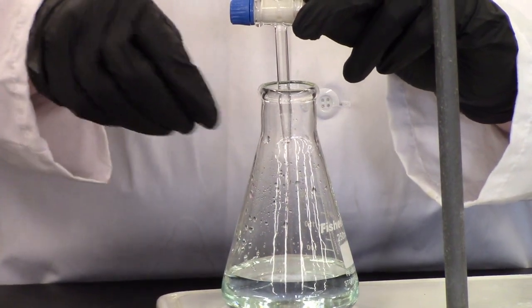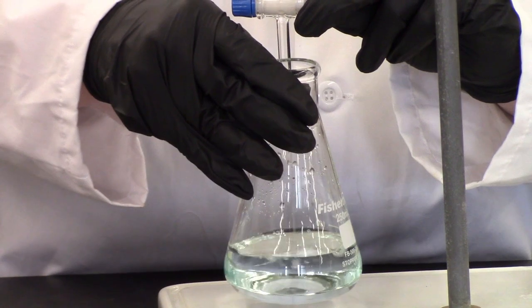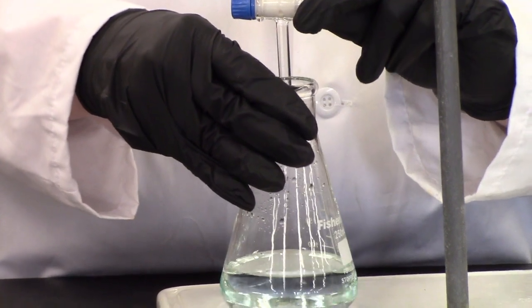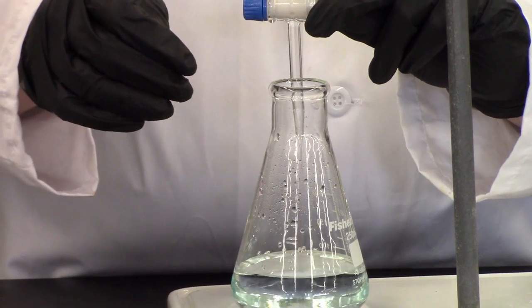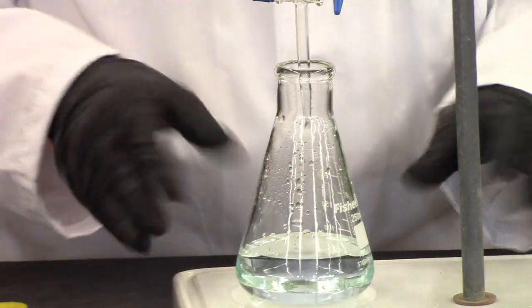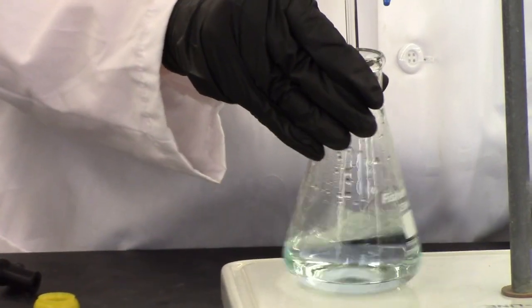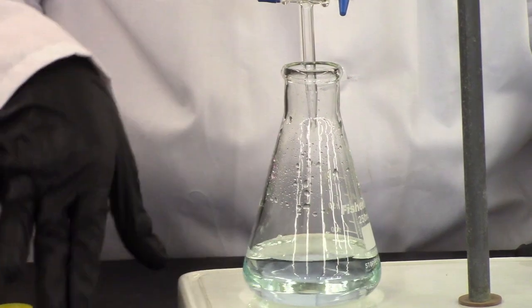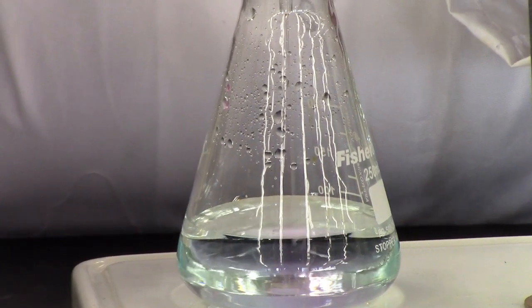So it's gonna persist a little bit and then disappear for quite a while, depending on the concentration of the acid. So I'm going drop-wise at this point, just little drops, and you can see that the pink cloud is there. The buret stands are white for a reason. It's easier to see this on a white surface than it is a darker surface. If you happen across a buret stand that's not white, just fold a piece of paper and put it underneath there, okay? So you can start to see this cloud a little better.